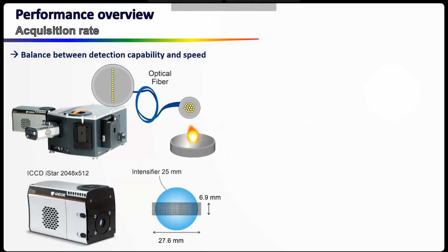And finally, the speed. As I said, we are working at 100 Hertz, these are all tabletop instruments. And also the second point is that we are using intensified CCD detectors here. So you have to read all the CCD matrix. And this takes time.